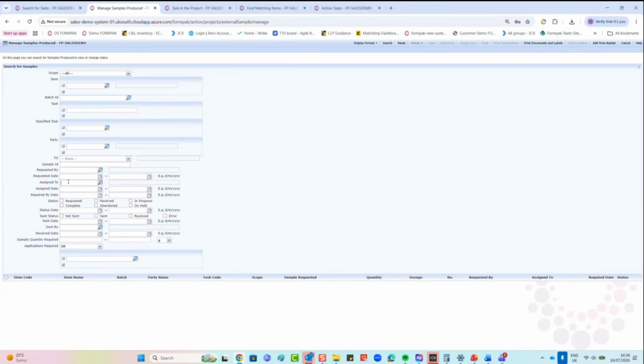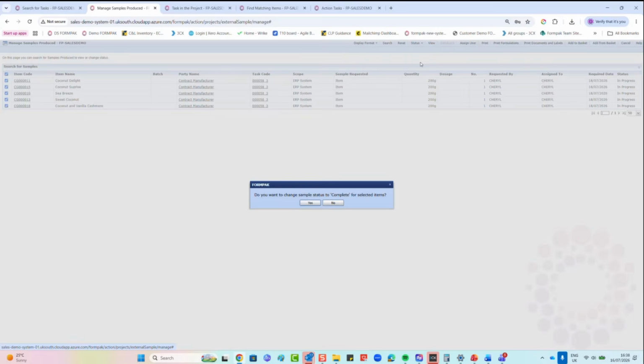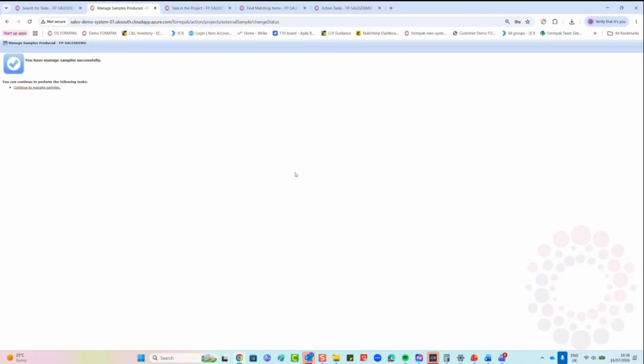Okay. And then once they've been worked on and they've been completed, what I'd do then is go back in, select in progress, click search, and change them to completed. So the samples are ready to go out the door. So I just need to let them know that they're now complete. And I'd change the status. So they're all completed. So that can then complete the lab stage of things.